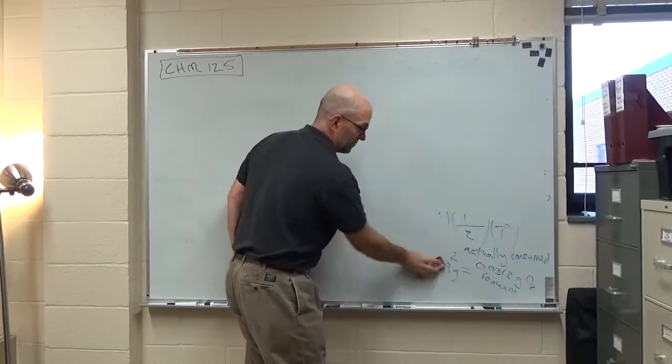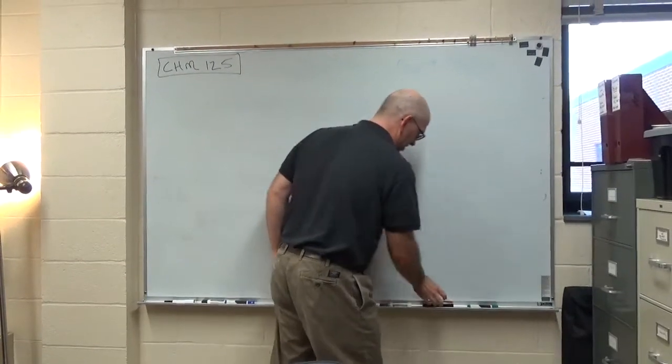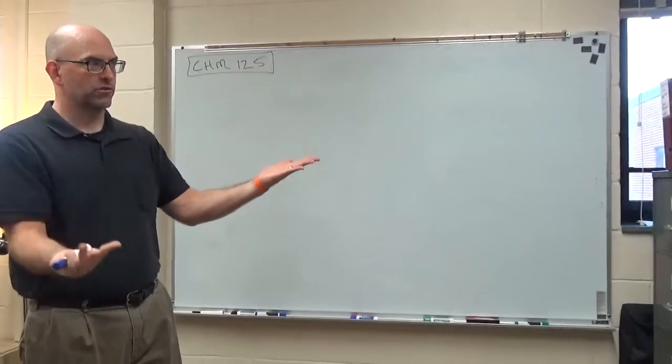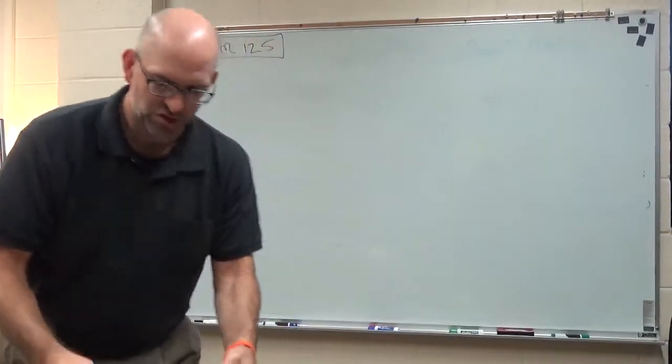So take a look at the procedure and see if you can start to pick out the amounts of each chemical and how we're giving it to you. Is it a solid? Is it a solution? Is it a pure liquid? What is it? So you'll do this on your own.